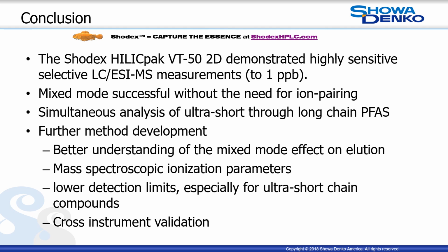Further method development includes better understanding of the mixed mode effect on elution, mass spec ionization parameter optimization, lower detection limits, especially for ultra-short chain compounds, and cross-instrument validation.